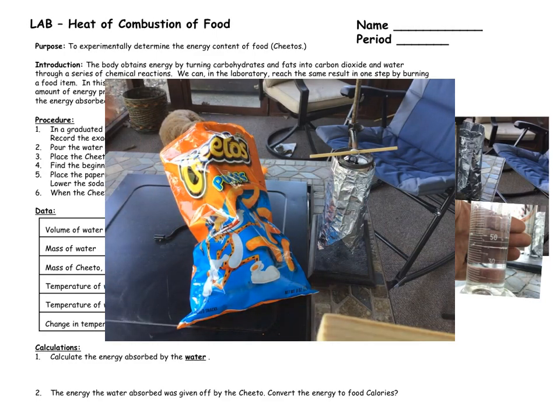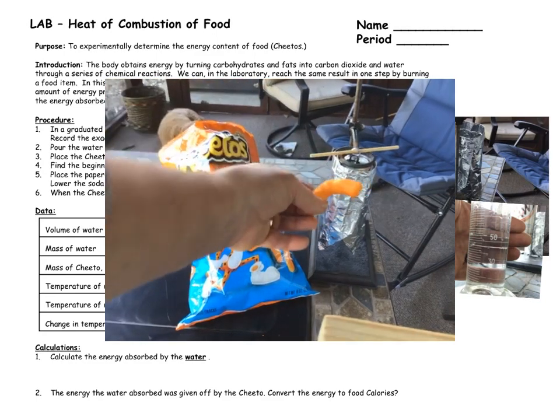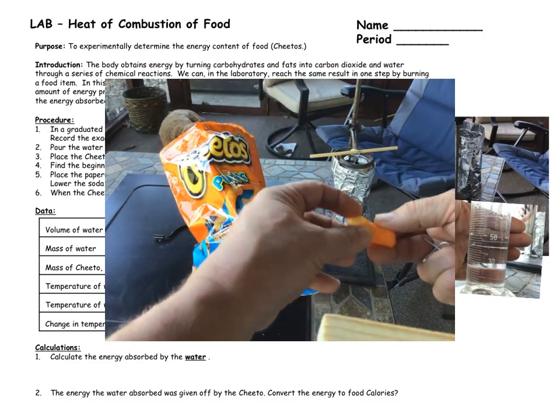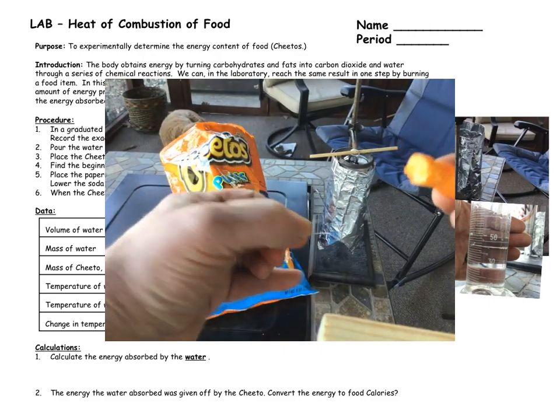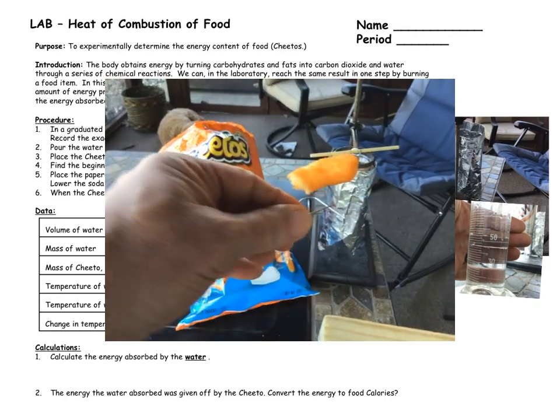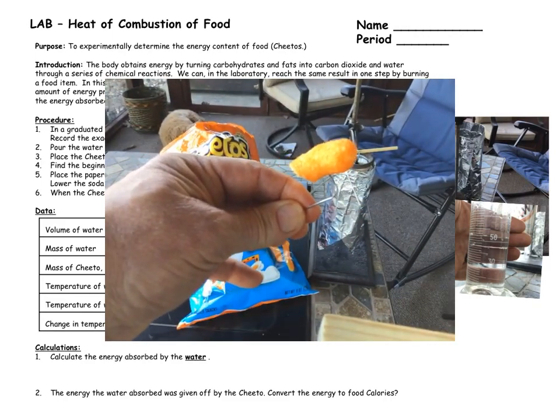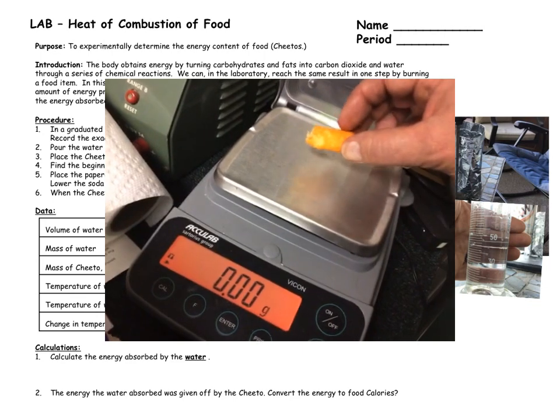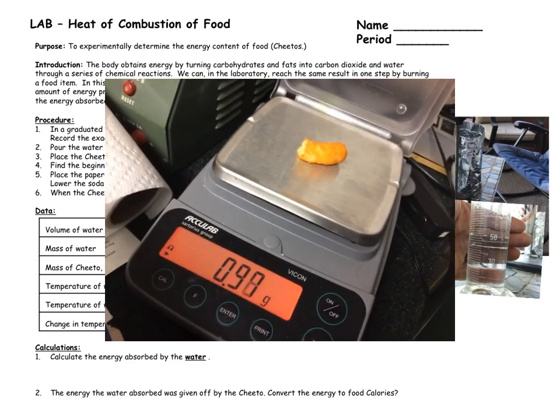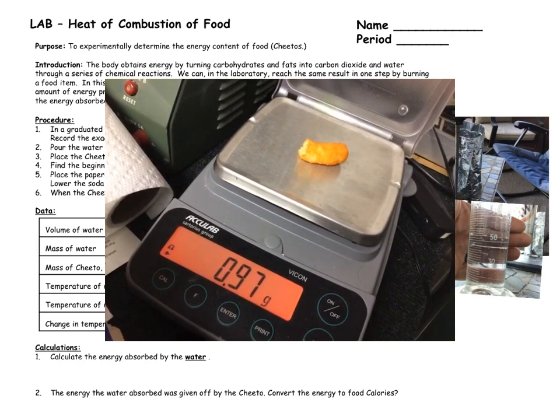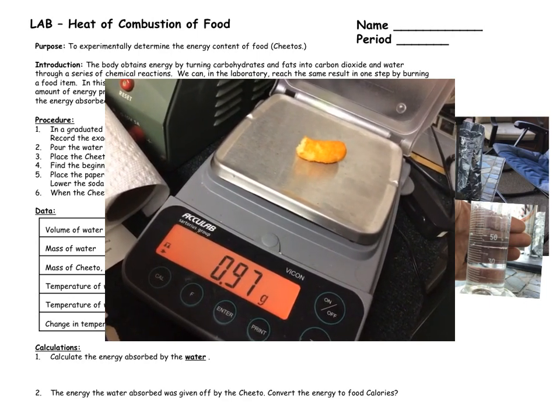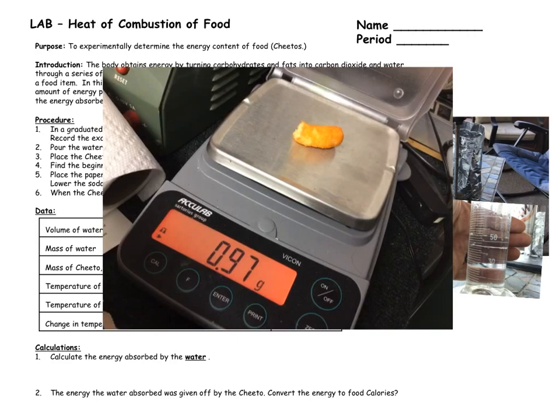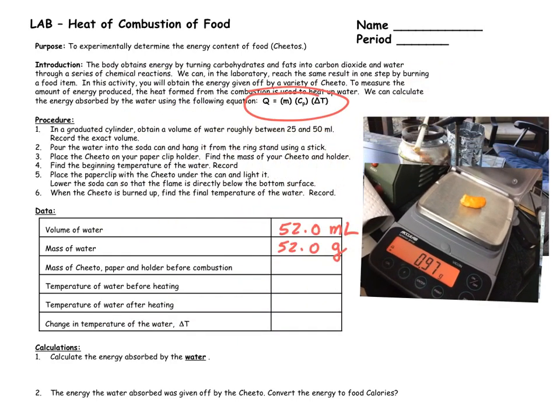Next, we have to prepare our Cheeto. We're going to use just a piece of Cheeto, and put it on this little paper clip stand so it can sit under the calorimeter. But first, we must find the mass of our Cheeto. The mass of the Cheeto is 0.97 grams.